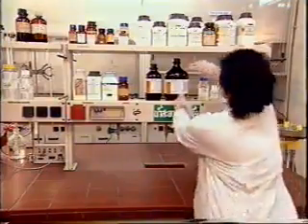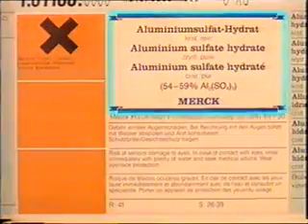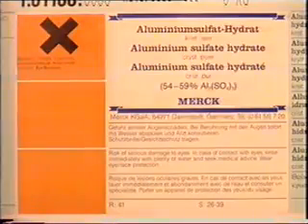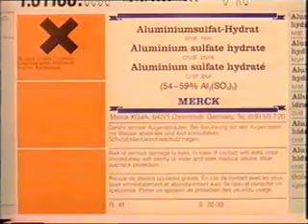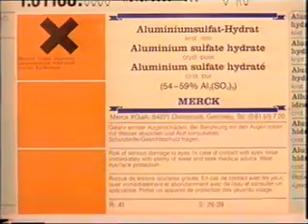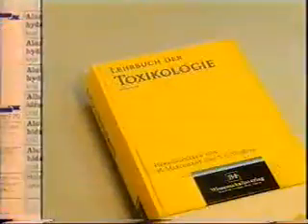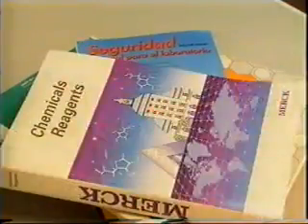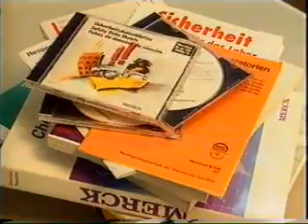Before you use chemicals, always inform yourself about possible dangers. Besides the name and the hazard symbol, you can find information about the specific dangers of the chemicals and also precautions on the labels of the bottle. Many labels contain, besides the direct safety information, additional information in risk phrases or R phrases and safety phrases or S phrases. Books and information materials of the labor associations provide more detailed information about the specific hazards of a chemical.